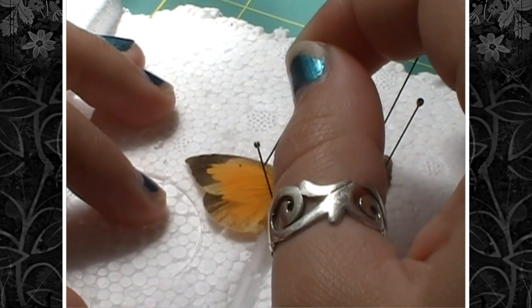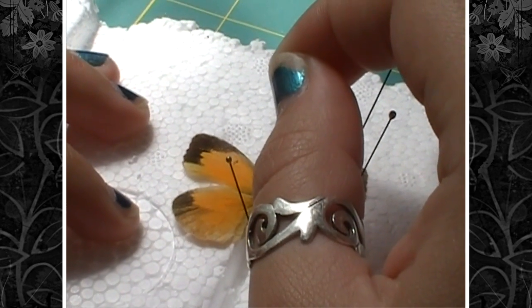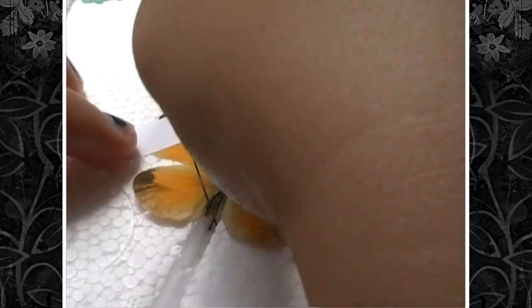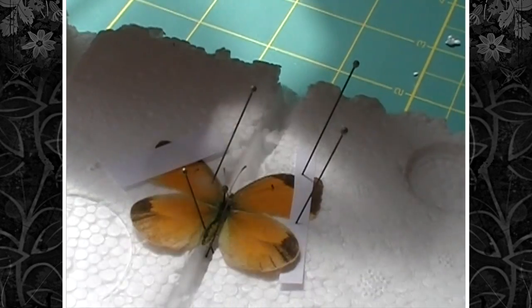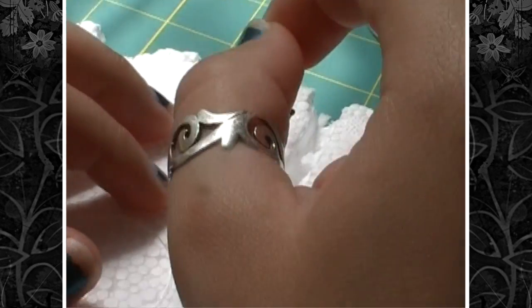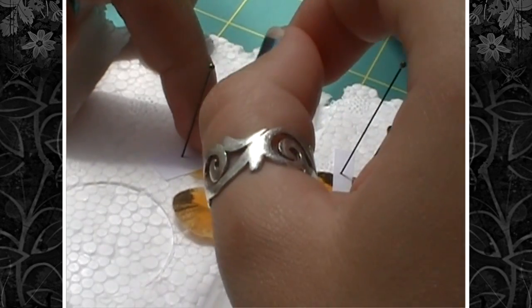You can't leave your pin in the wing because when it dries, you'll get a giant gaping hole and it won't look very nice. So get your piece of paper and more insect pins, and pin right below the wing and then right above the wing.